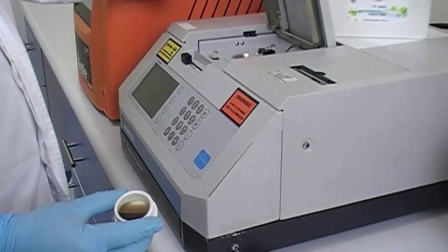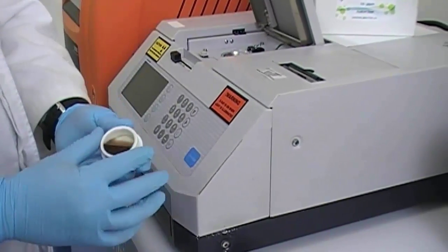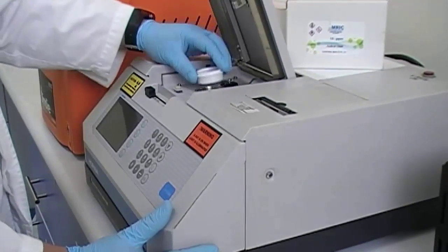You will be able to test equipment as HORIBA ASTM D4294.